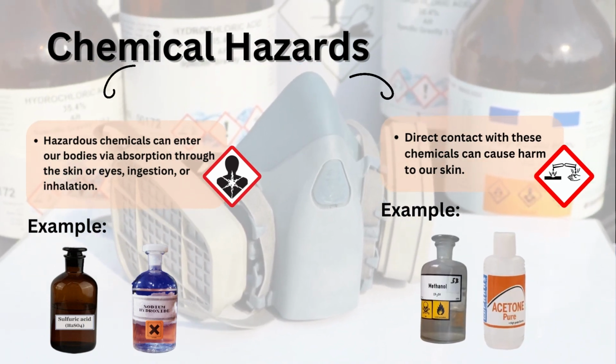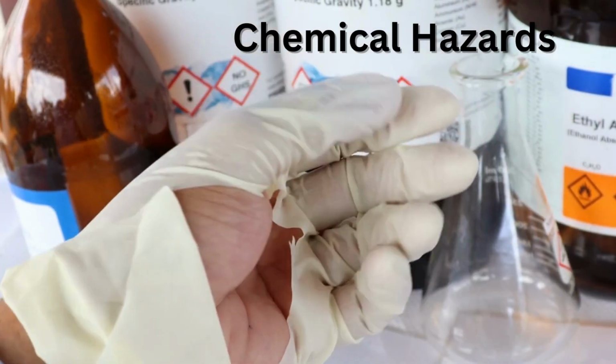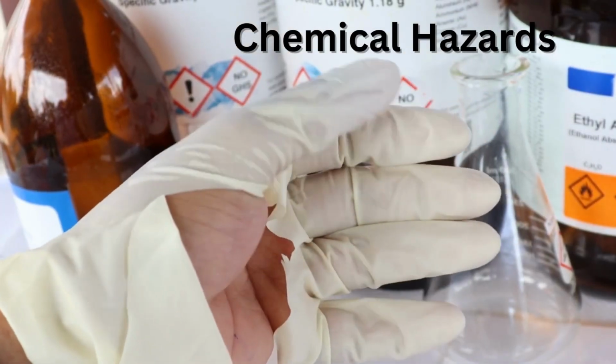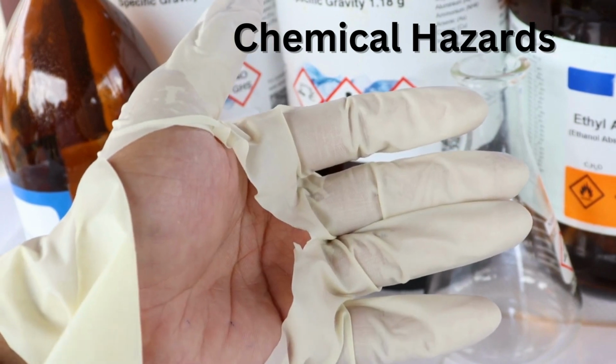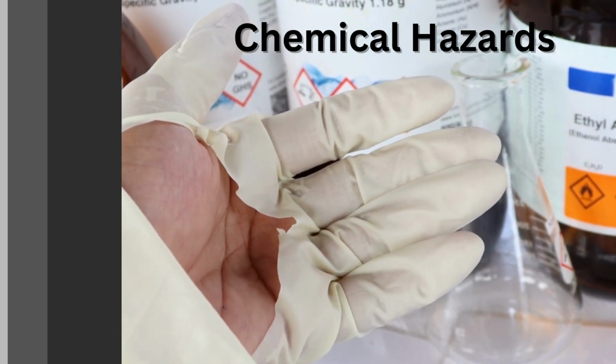Methanol and acetone are examples of flammable chemicals. These chemicals are classified as flammable because they can easily burn or ignite when exposed to oxygen. Hence, exposure to these hazardous chemicals can result in illness, skin rashes, and death.